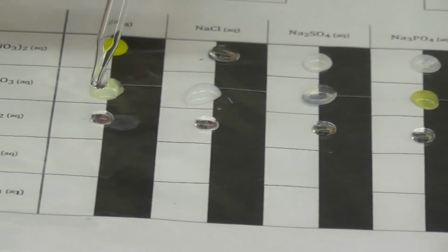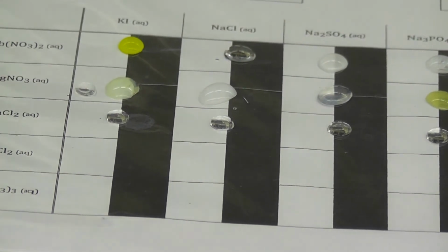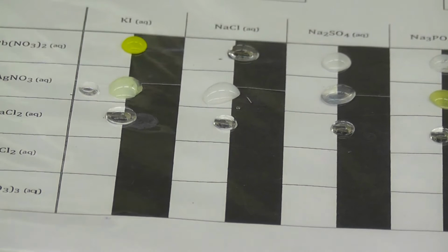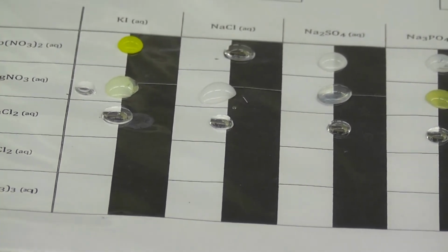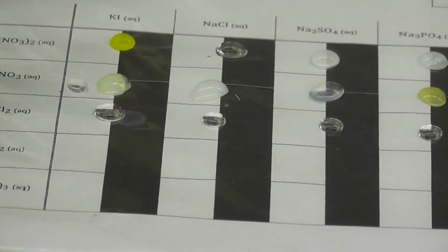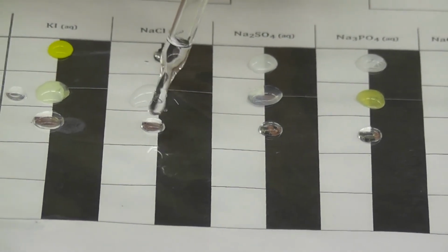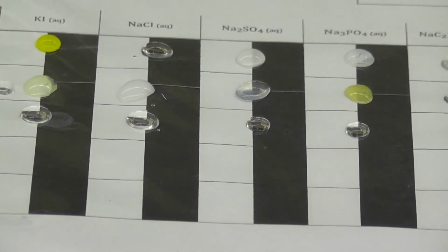Oh, give me a second. Okay. Drop there. And that's the reaction between calcium chloride and potassium iodide. Okay, so now we're going to be using the sodium chloride with the calcium chloride. Let's see what happens. Ooh. Okay, that's what happens between sodium chloride and calcium chloride.